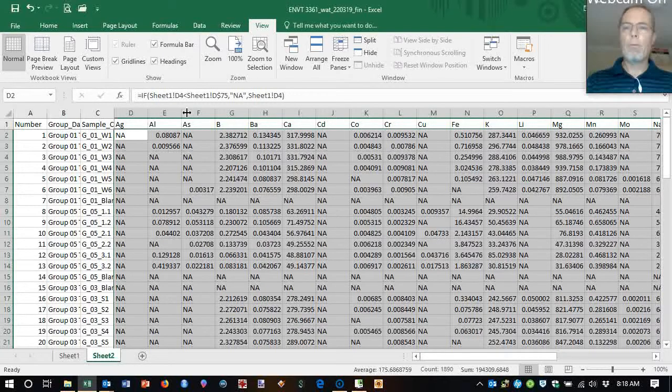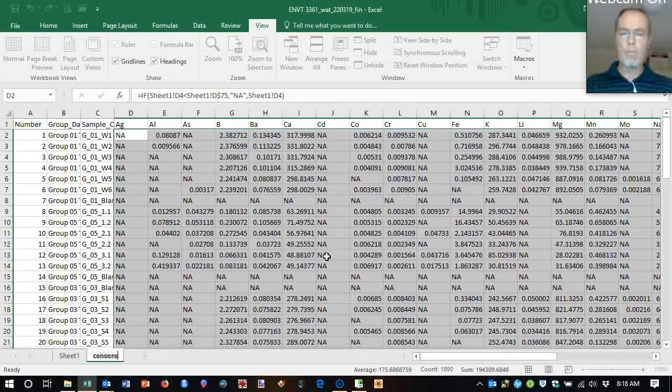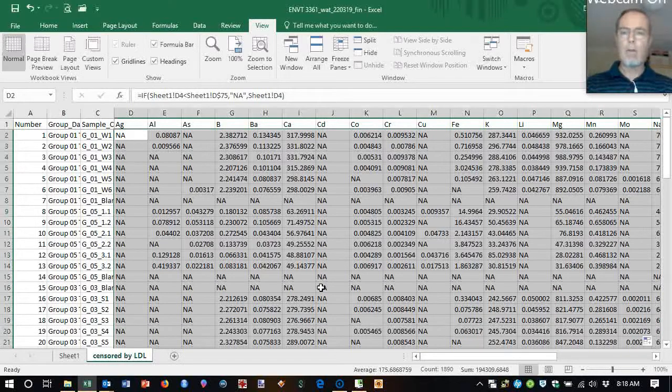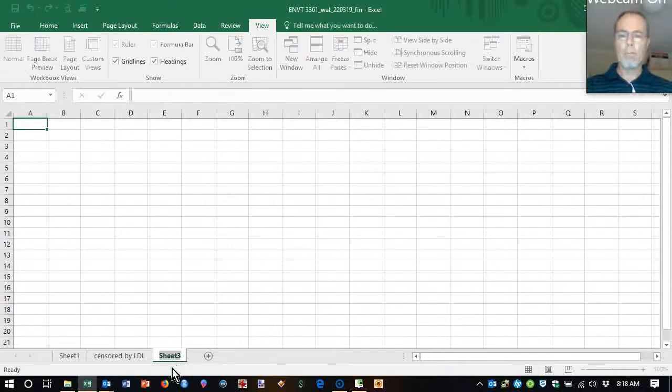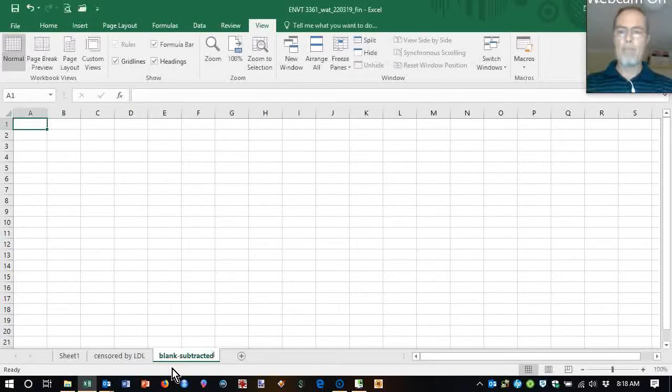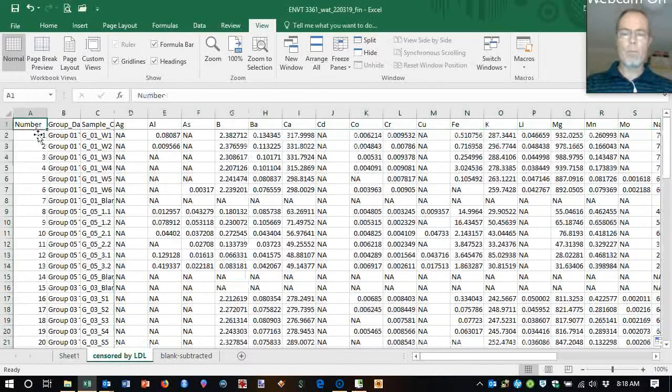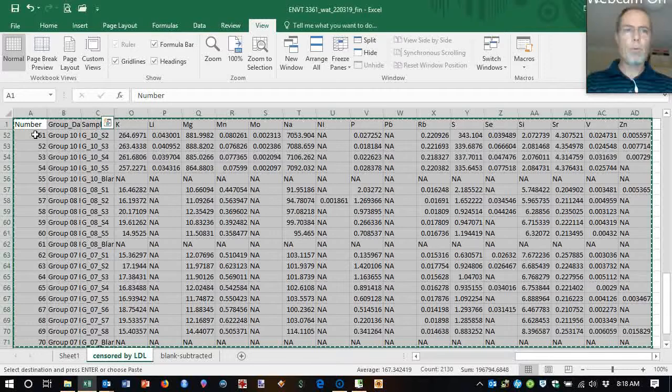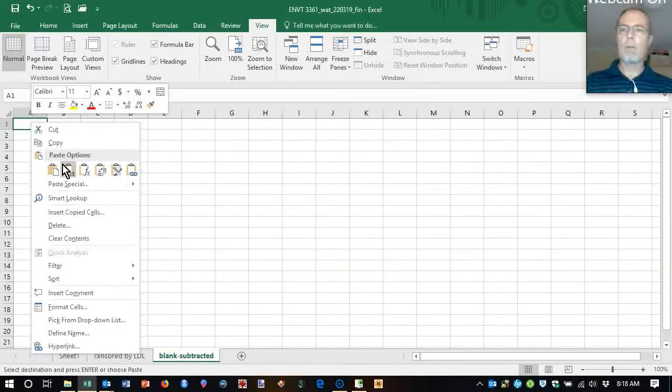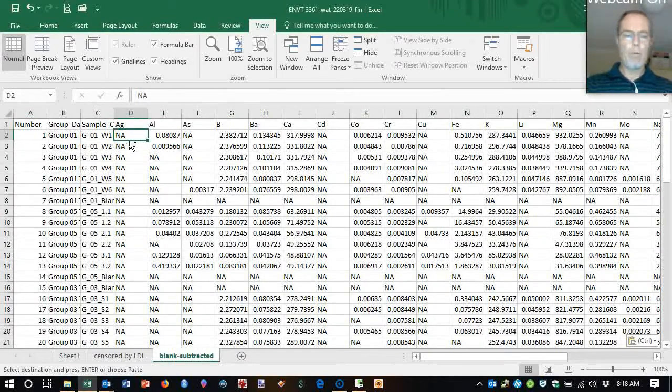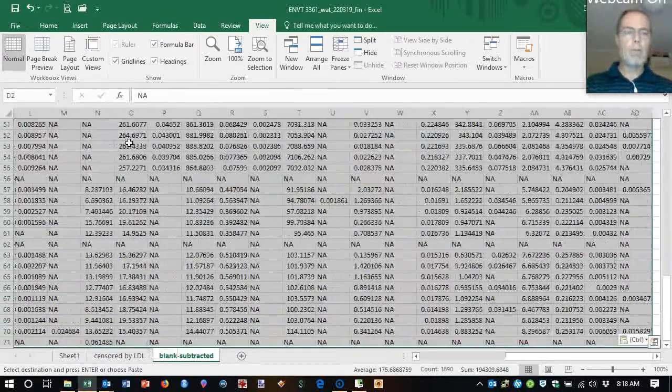All right, so this is, it's good to keep track of what we're doing. Censored by low detection limit. And I'm going to actually make another sheet which I'm going to call blank subtracted. This will be our final sheet. So we will copy all of those and again just paste them as values and get rid of everything there.